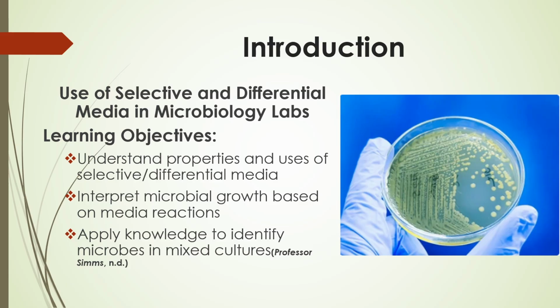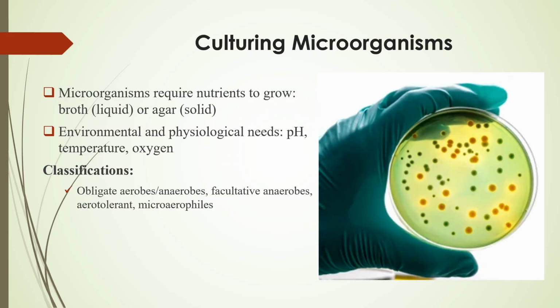The general purpose is to explain how these media function, while the specific purpose is to show how microbial traits like sugar fermentation or salt tolerance can be used to distinguish between species. Upon conclusion of this presentation, you will comprehend how selective and differential media facilitate precise and effective microbiological identification in laboratory and clinical environments.